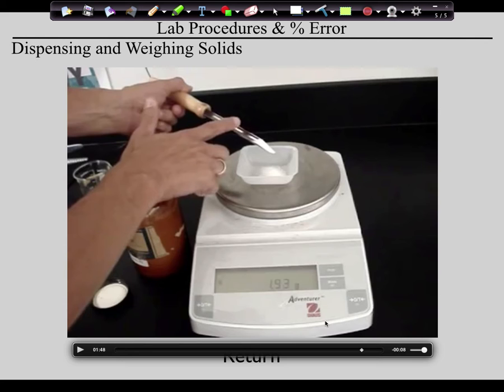Now, what if they put too much stuff in here? Can that go back in the bottle? No. So here's the question, because it's going to happen to you. What happens if you get too much stuff in your weighing boat? Throw it away. If you get too much stuff, you can scoop a little bit of it out with your spatula and literally throw it in the trash. Then put it back on the balance, get a little bit more out of the stock bottle, and try to sneak up on it again. Do you get the idea? So anything on the spatula is okay to put back, but if it's in the weighing boat, never put it back.